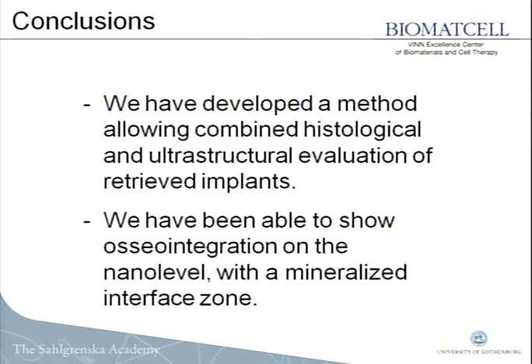And we have also been able to show that you have a mineralized interface, which has been discussed in the 80s in the dental field, where they always found a proteoglycan layer at the interface, but with modern tools, you can see much more than with the tools in the past.